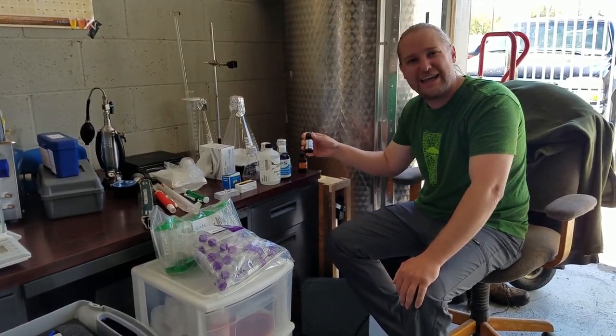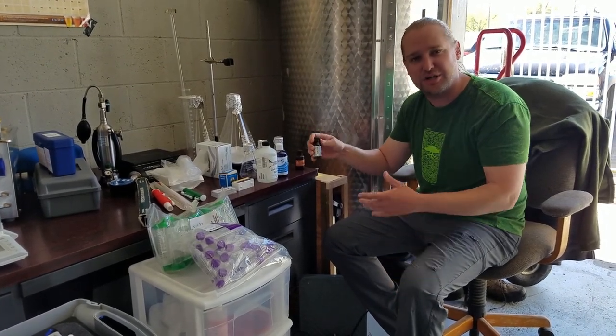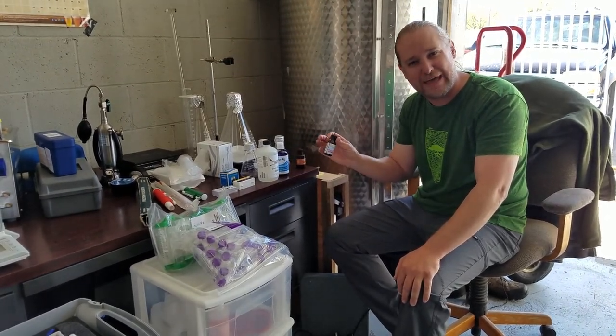We have a little iodine here if you want to do an iodine test on our starch conversion in our mash tun, making sure our temperature probes are right. It's good to keep a little bottle of iodine around so you can run that test.